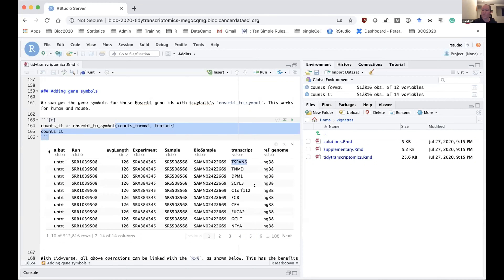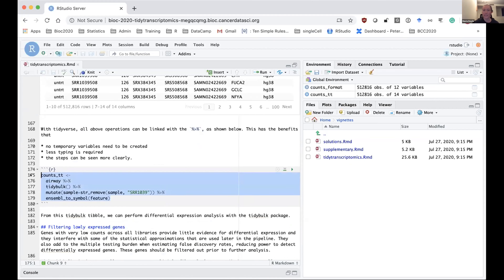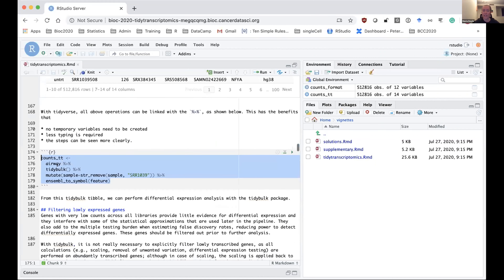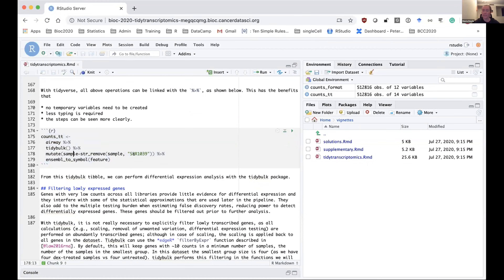A nice thing about tidyverse and the tidybulk packages is that we can link the different functions using the pipe operator. This is shown here — running the same steps already performed, except chaining them together with the pipe. The benefits are that we create fewer temporary variables, less typing is required, and it's easier to see the steps. You can see we've loaded the data, converted to the tidybulk table format, stripped off the sample prefix, and then got our gene symbols.